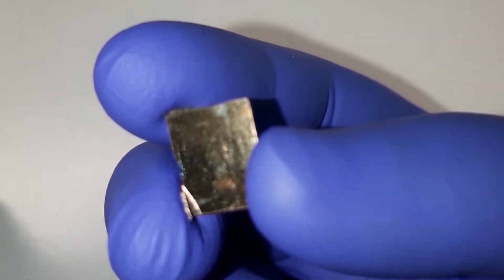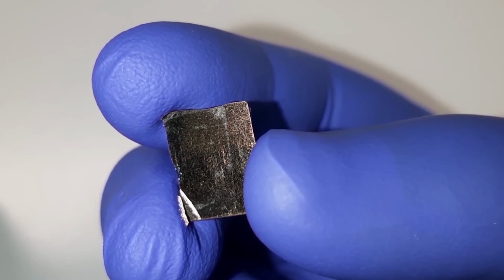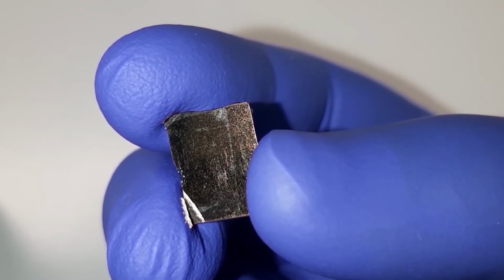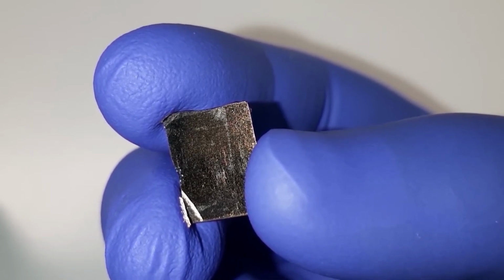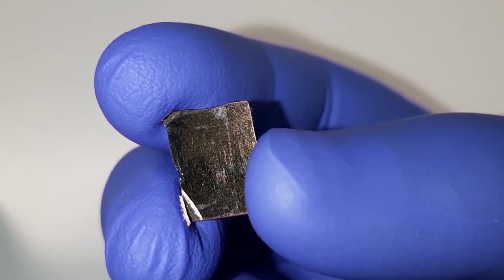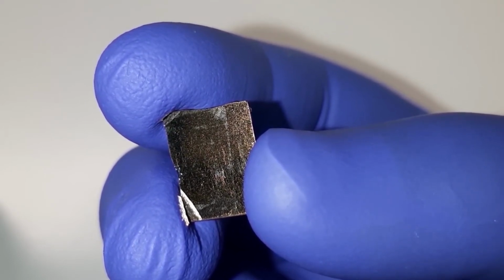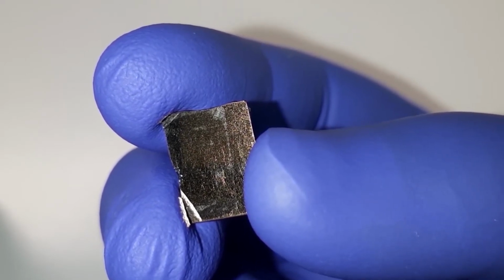This chip consists of an SF10 microscopic glass plate which is coated by two metal layers. The first one, the adhesion layer, is a layer of titanium which has 5 nanometer thickness.